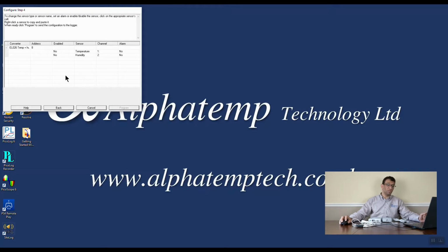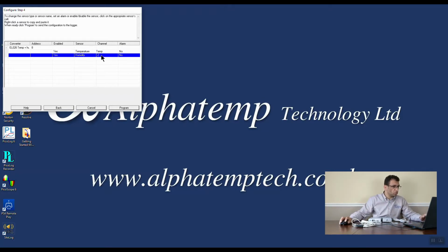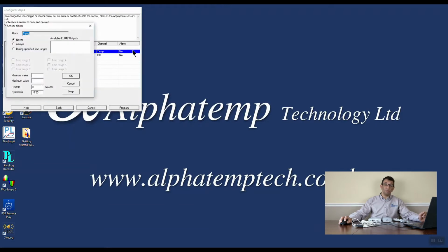Now what we need to do is enable the channels. If you double click next to the temperature channel and change it from no to yes, and do the same with humidity. And if we double click on the actual channel number, we can give it a name. So for channel 1 we'll call it temp, and for channel 2 we'll call it RH. You also notice that there's alarm options over there. If we double click on alarms, the alarm menu will appear. We'll cover that in another video, so we'll leave that off by default.